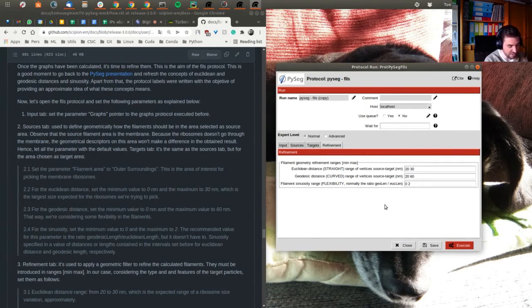You can refine these filaments, the ones you have obtained after combining the constraints in the source area, the constraints on the target area, and with those resulting filaments, you can again apply a final filter, considering them traced in the correct areas, and after the constraints fixed before, apply this other distance, not considering the areas anymore, just the final over the final product.